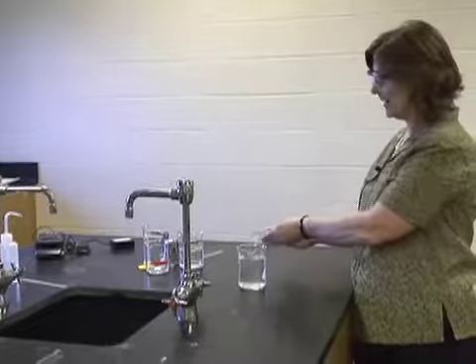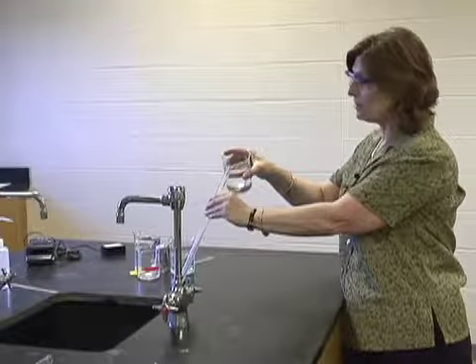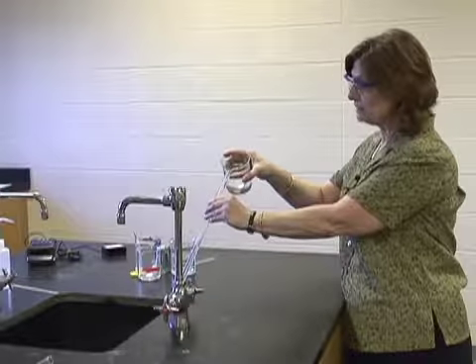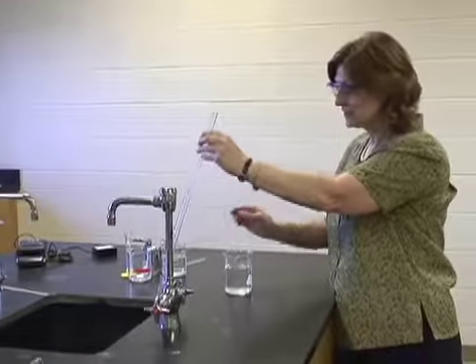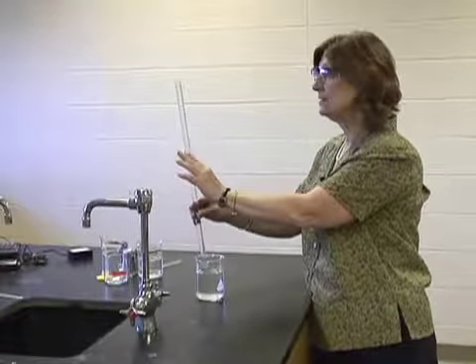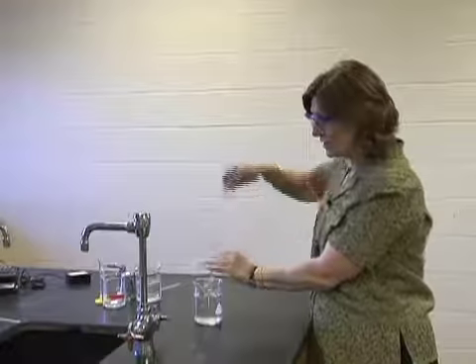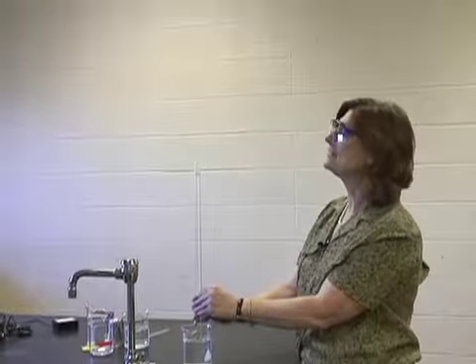I'd like it to go up a little bit more, so I will try it one more time. I don't have to worry about taking the water out because I'm just going to put more water in. And I did have it all the way up, so I will practice this one more time. Students always get worried about this, but you just try it. What could go wrong? Worst thing is you maybe could break the eudiometer, I suppose, but it's replaceable. Now I'm going to quickly invert it again and see, and I seem to be consistent, and my volume is even less, but that will work for our purposes.